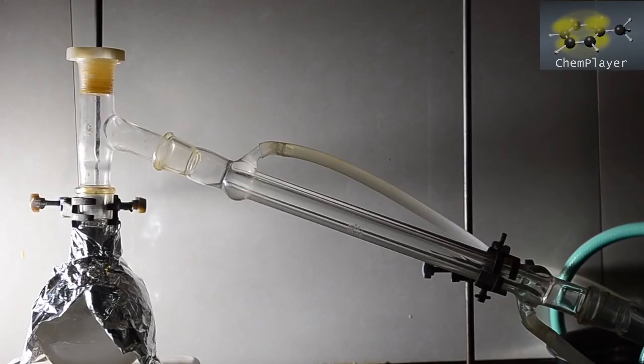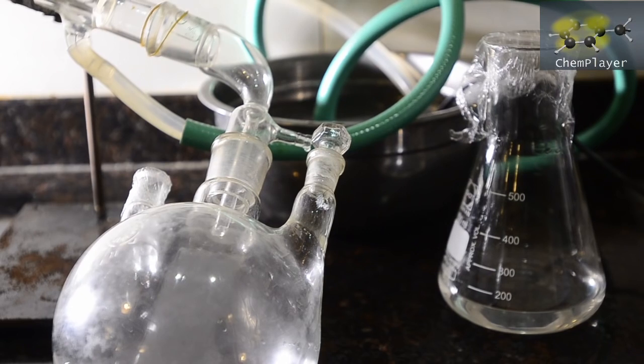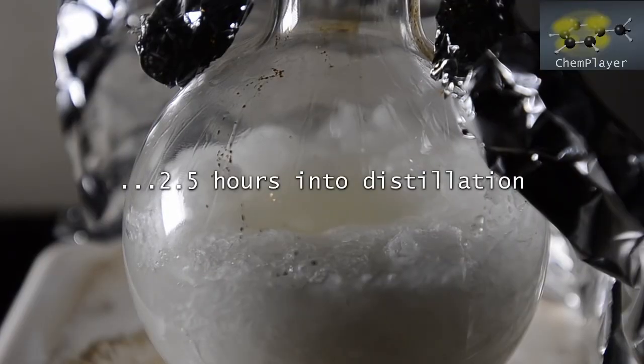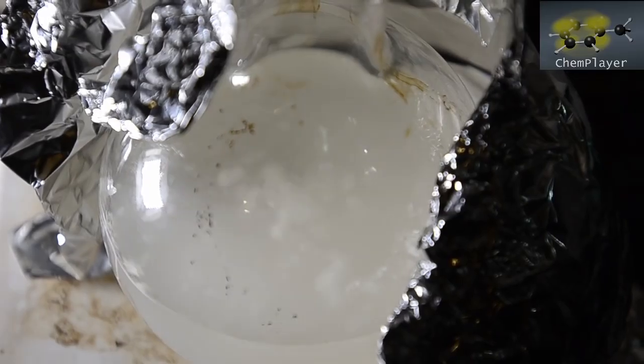After this point the water addition process became easier and we were able to add carefully in 25 ml portions to the boiling mixture. We added about 200 ml of water in total to the reaction mixture and kept distilling. Towards the end of the water addition, the solid white sodium hydroxide in the boiling flask started to dissolve, and eventually formed a solution.